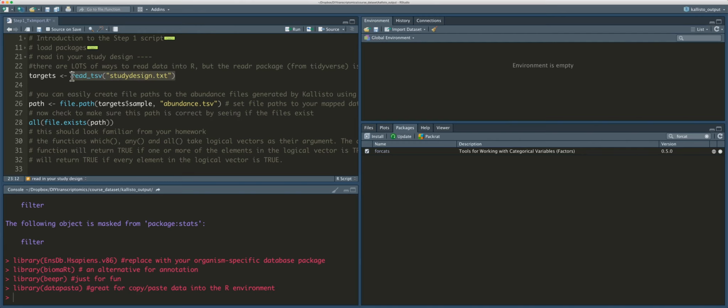Well, it takes the result of running this function with these arguments, and it puts the result into an object that you've called targets. Now, it's important you understand name here doesn't matter. We could just call this T. We could call it my thing. It doesn't matter. I'm calling it targets, and I'll call it targets throughout the course, but that's just the label I've chosen. You can call things whatever you want. It doesn't change the nature of what's created here. It just changes the way you'll call on it down the road.